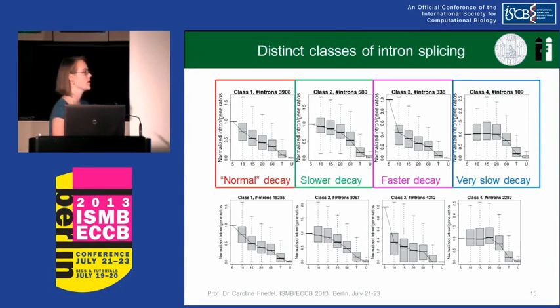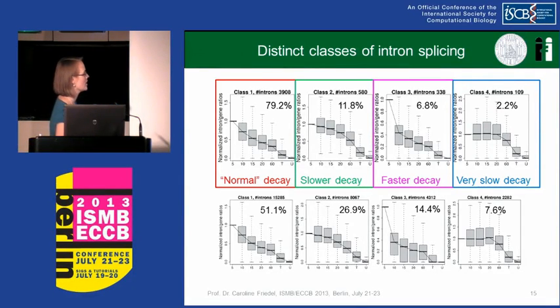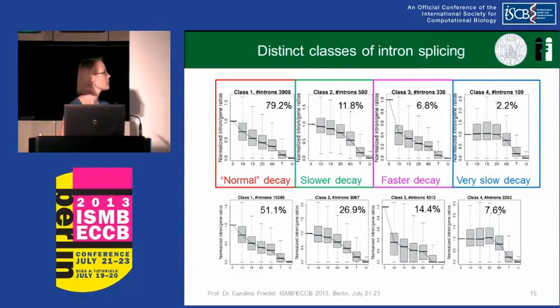And this is how the plots look if you use all of these introns, and you can see that the pattern is pretty much the same as here. What changes a bit is the relative frequency of each class. So if you look at all introns, we actually see that the normal decay class is a little bit less frequent, and the other class is a bit more frequent, but which class is most frequent and which class is less frequent doesn't change.